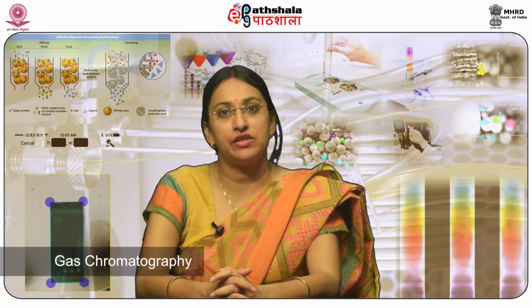Nature of mobile phase. Mobile phase is a liquid solvent in a liquid chromatography system, and it can be a gas in a gas chromatography system. In liquid chromatography, it can be a polar or a non-polar solvent, or it can be acidic or basic in nature, and so on. Commonly used HPLC mobile phases are water, aqueous buffers, organic solvents, or mixtures of organic solvents. While running the chromatography in an isocratic mode, the composition of the mobile phase is kept uniform throughout the analytical run, whereas while doing gradient elution, the mobile phase composition can be changed to obtain a pH gradient or a polarity gradient.